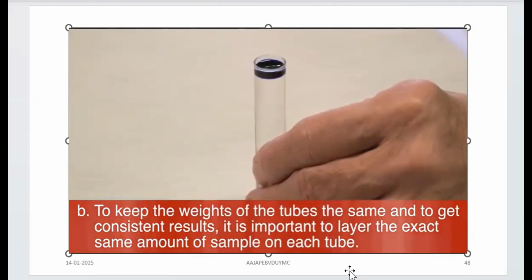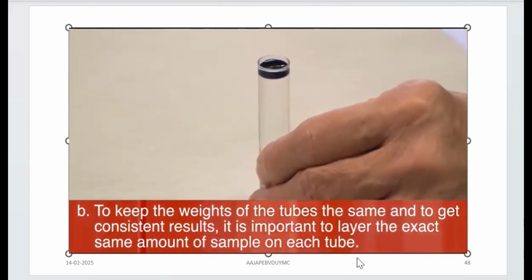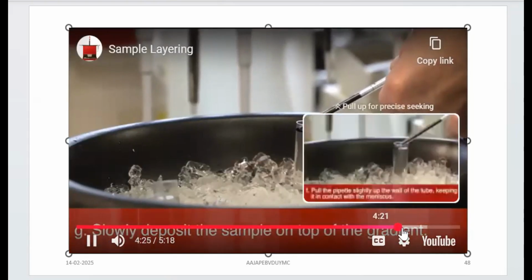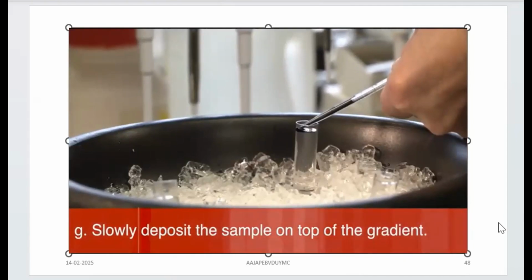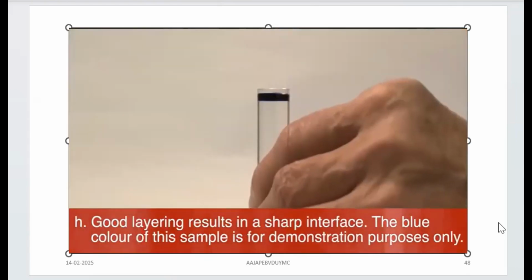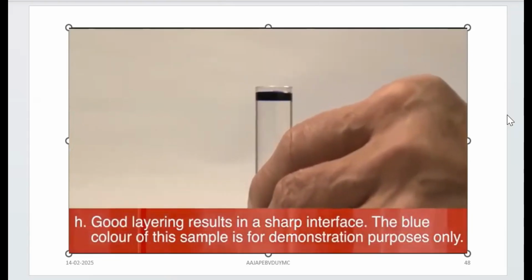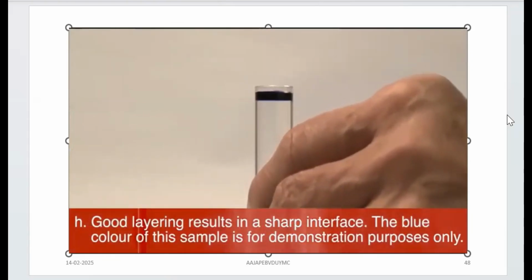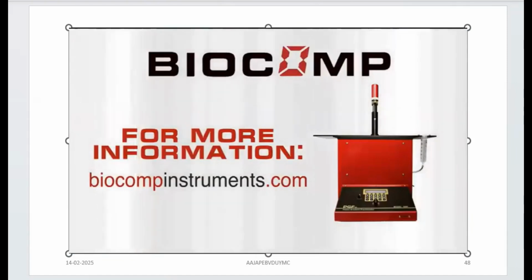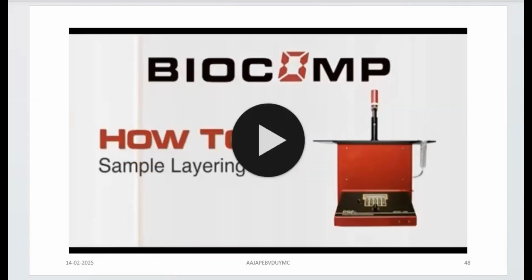It is important to layer the exact same amount of sample on each tube, right? That is very important. See how carefully the sample is getting loaded on the top of the gradient so that it slowly spreads over the surface of the liquid column, the gradient column, right? Yeah, a very uniform layer. And you can very well see the sharp interface of the two layers, right? So this is just an overview. One more thing is to be shared, but at the end of the lecture.